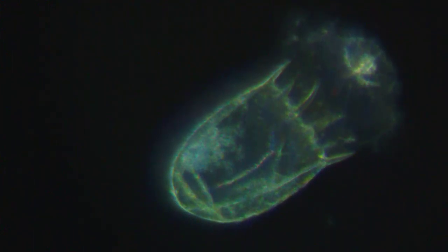Lost my view. I got to go back to the second objective. Try to find this guy again. Where'd he go? No, that's not it. What happened? I lost it. Oh, there he is. There you are. I found you. Pretty cool looking. Almost looks like an acorn or something. He's got those little spikes.